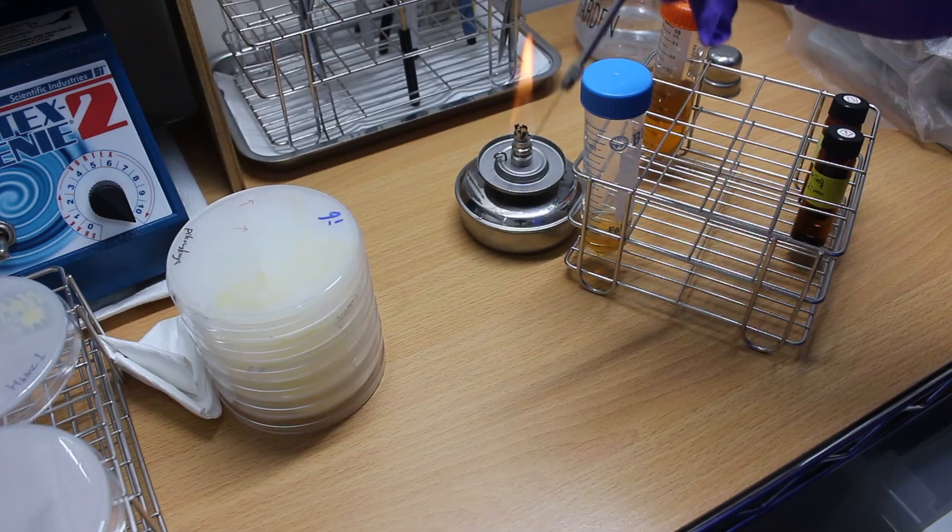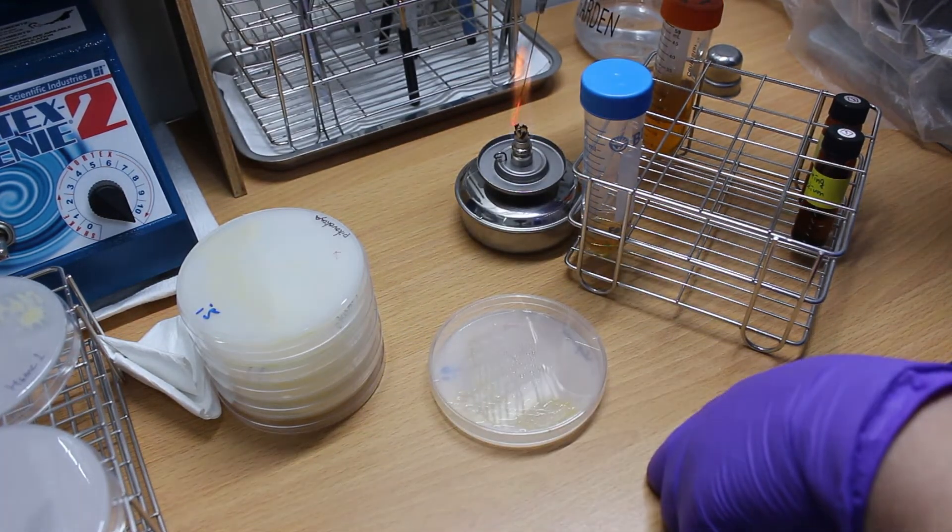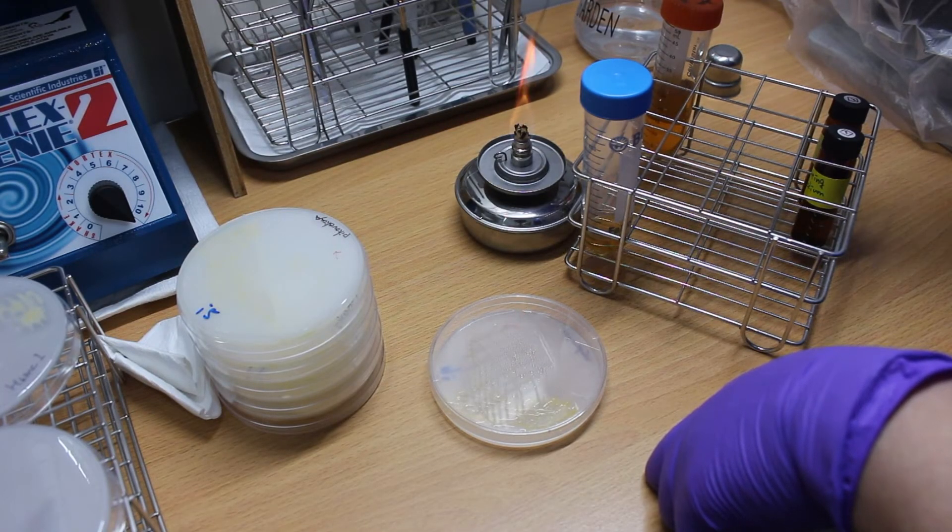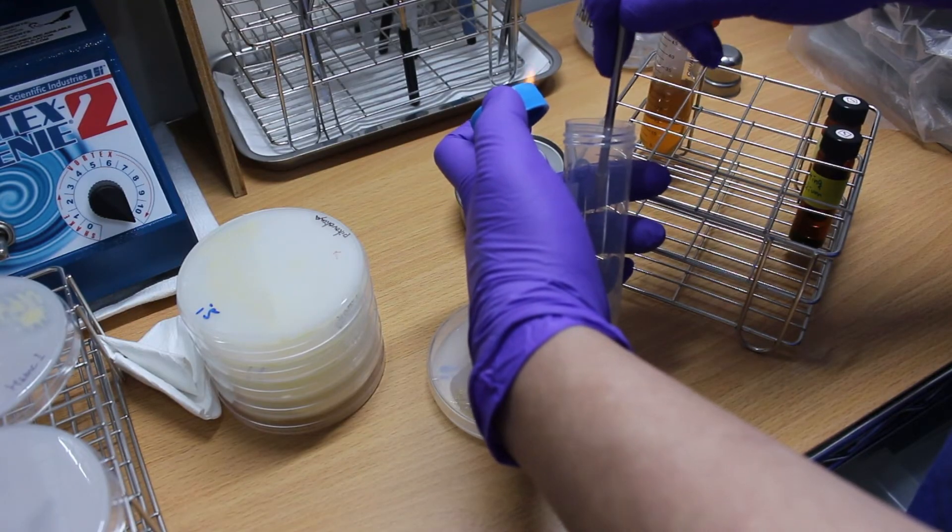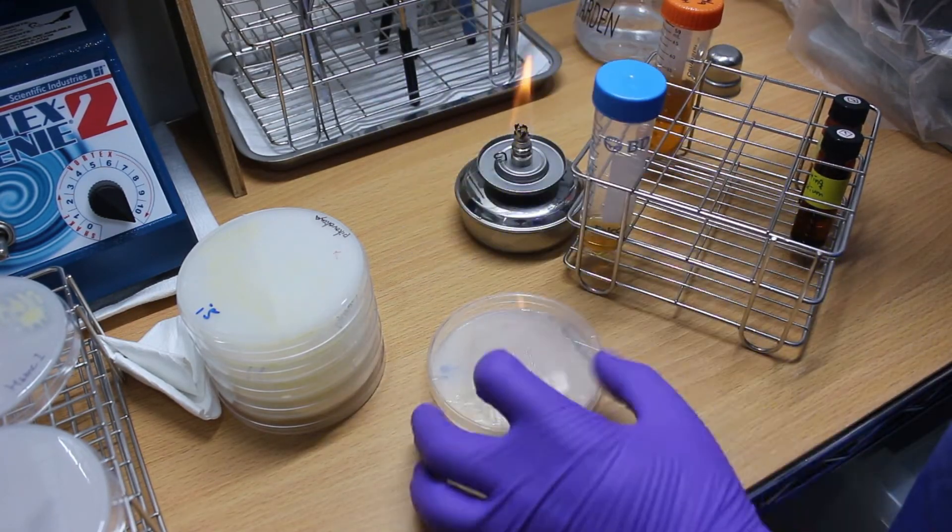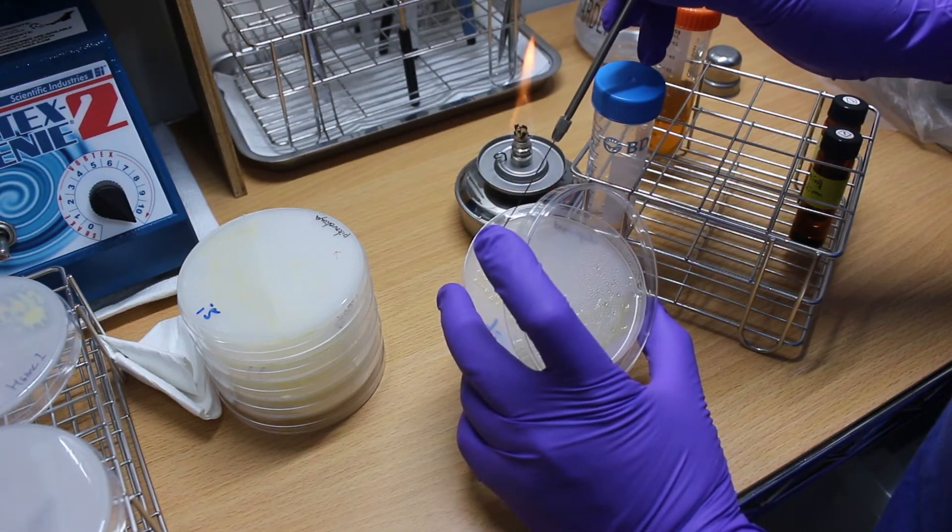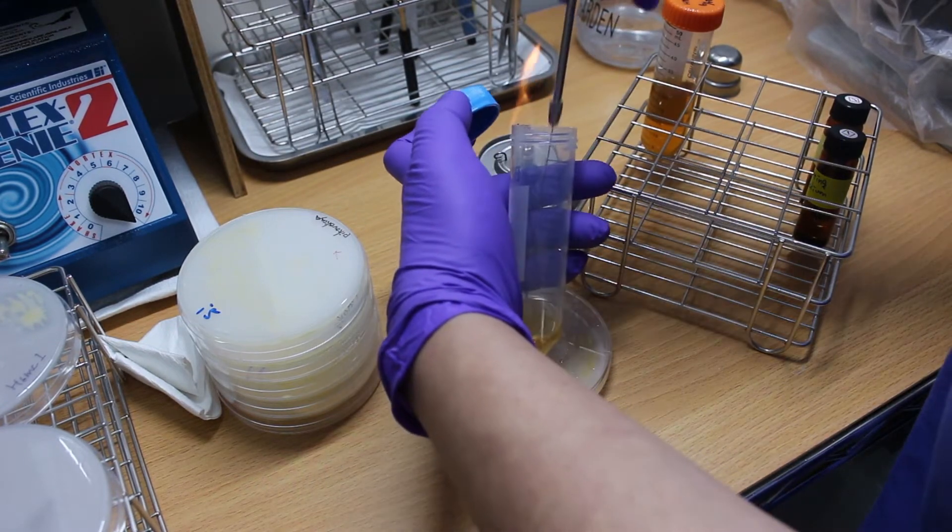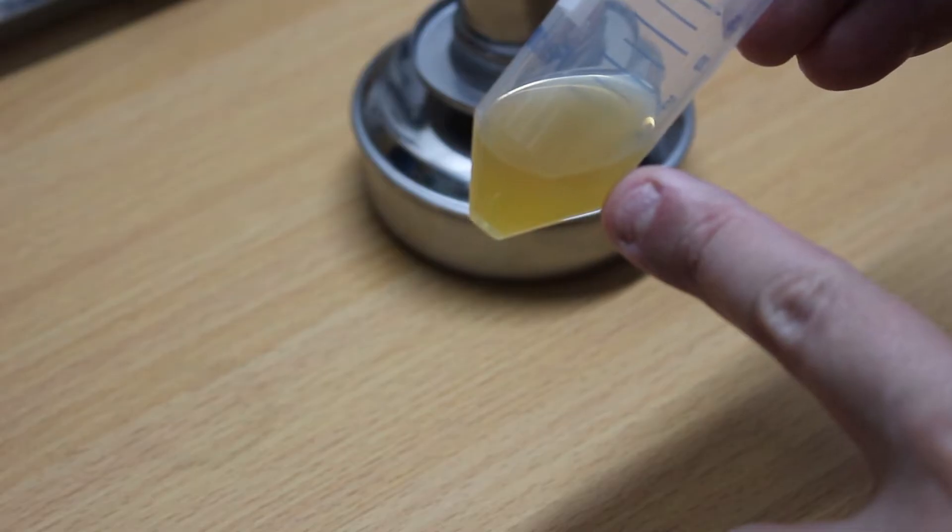Next, we need to cultivate the PSB to increase its quantity. I'll use a gradual increase method to reduce the chance of contamination. First, I use an inoculation loop to transfer a single colony into 10 to 20 milliliters of culture medium, which will be incubated at room temperature. When the culture medium becomes cloudy, it means the bacteria have grown.